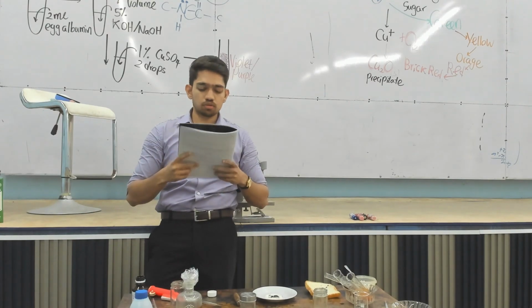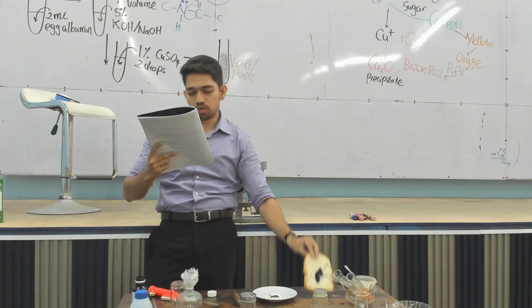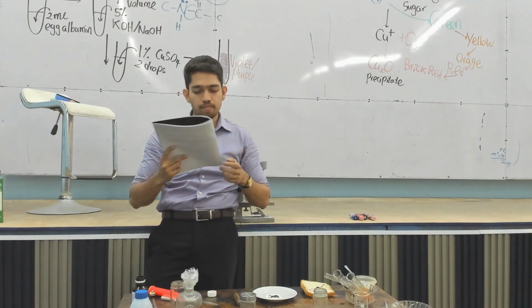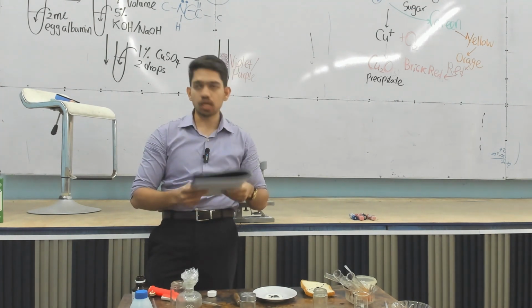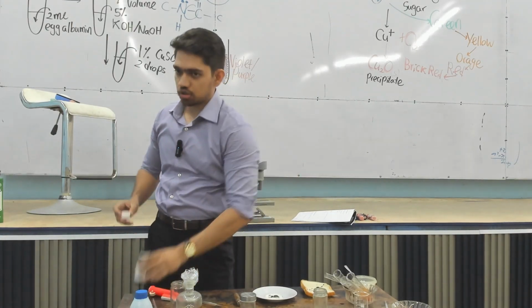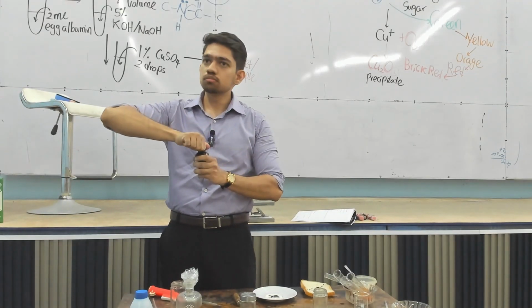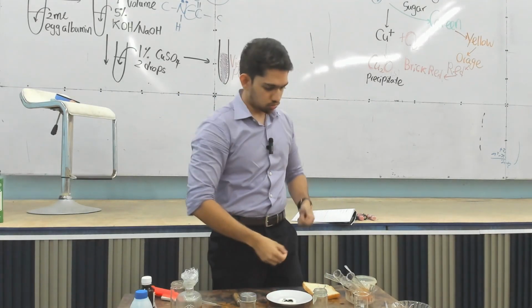Okay, so this is the solid experiment that we did. Add 2 milliliters of 1% starch solution to a test tube, then a few drops of iodine in potassium iodide. A blue black color is observed. Okay, pretty simple experiment. So that is how you identify starch. Any questions? Let's do the next experiment quickly also, right?